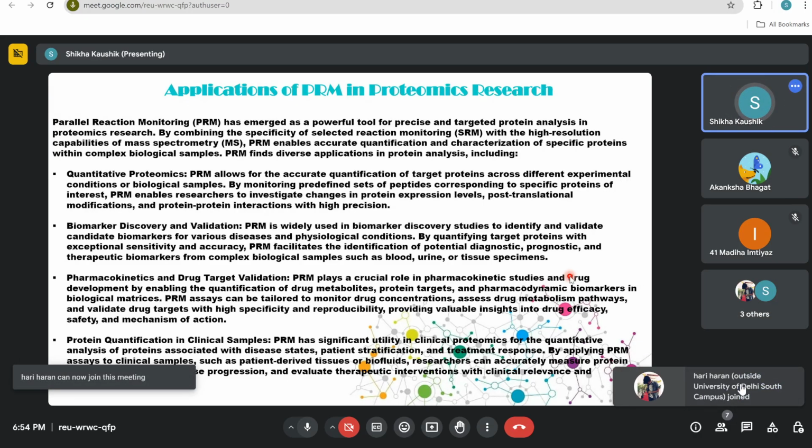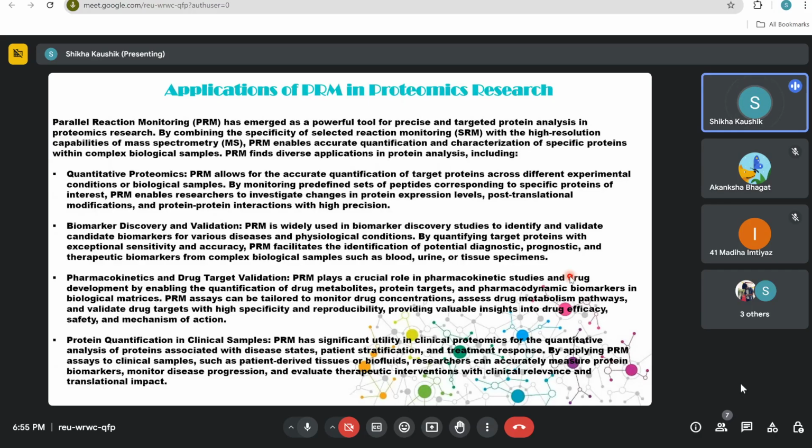So we can select that biomarkers, and that's how this particular technique helps in बायोमार्कर डिस्कवरी एंड वैलिडेशन भी बहुत ईजी है, क्योंकि हम एक पर्टिकुलर प्रिकर्सर को सेलेक्ट कर रहे हैं, तो उस प्रिकर्सर को जब भी मैं रिप्रोड्यूसिबिलिटी ऑफ दिस पर्टिकुलर सैंपल करूंगी तो वो भी एक तो ज्यादा होगी, और प्लस हम वैलिडेट कर सकते हैं हमारे और टेक्निक्स से निकले हुए बायोमार्कर्स को with the help of PRM.